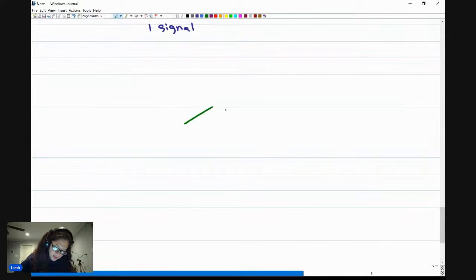And so if you see something like this on your exam, here is how I recommend breaking it down. First, I like to mark the carbon atoms, either by drawing in quick hydrogens if I'm trying to count, or just putting a circle to say, hey, this is a unique carbon atom. I notice that this is a linear molecule with symmetry down the middle. So I recognize that this is also a CH3, same exact. And then I see that I have a CH2 here, which is the same as the CH2 here. And once again, I get my two signals.